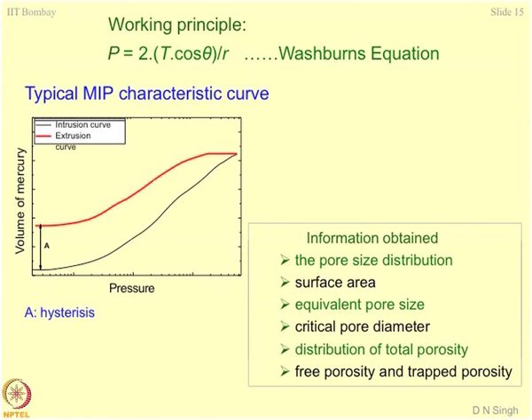If pores were perfectly elastic, what would have happened? All the mercury would have come out. Exactly. So the red line and the black line would have got superimposed perfectly over each other. That's right. So no loss of mercury, no loss of pores, and so on. That's what I said. The way you characterize your ferromagnetic materials and non-ferromagnetic materials, what is the differentiation? It's just based on the amount of magnetic energy which they store. Exactly. That's what we are doing.